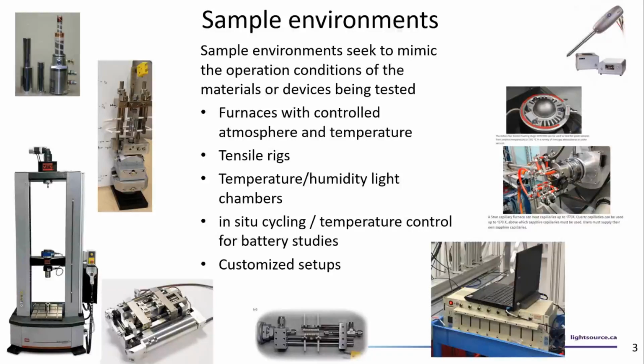This is a stress rig for tension and compression that we recently bought and we are commissioning to make it available for the users. This is another little furnace that Adam and Joel came up with to study in-situ cement setting, and finding out what phases go on and off during the curing of cement paste.